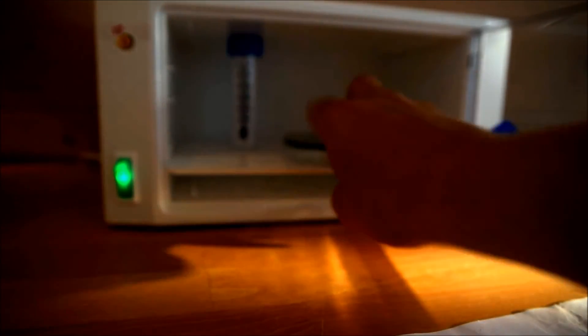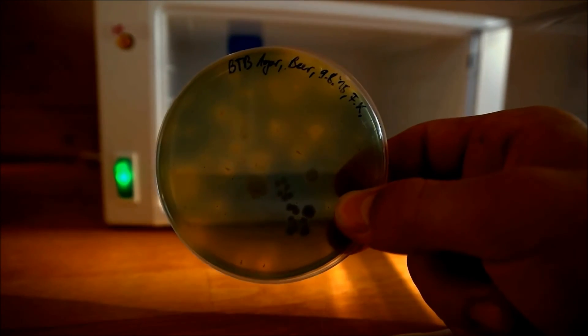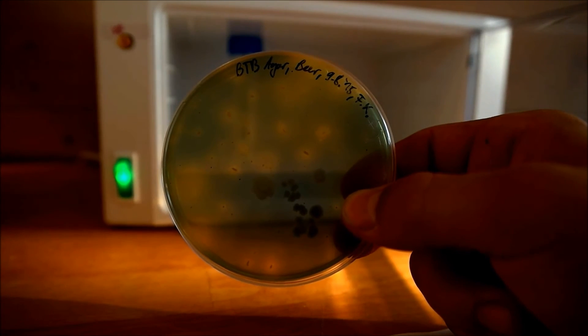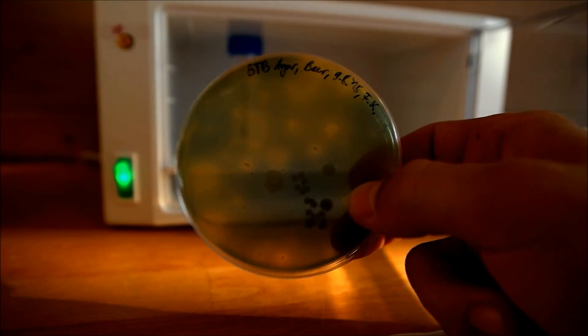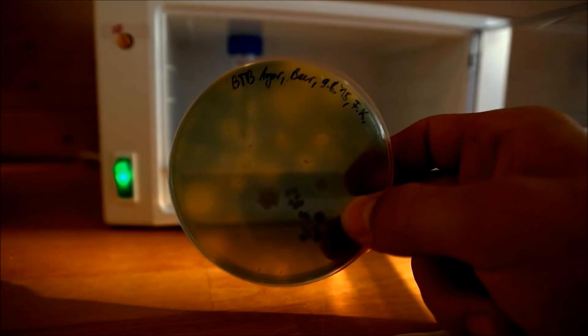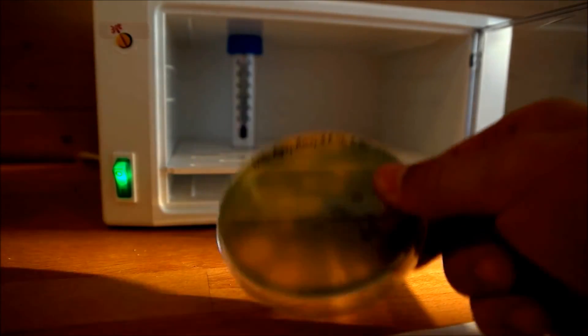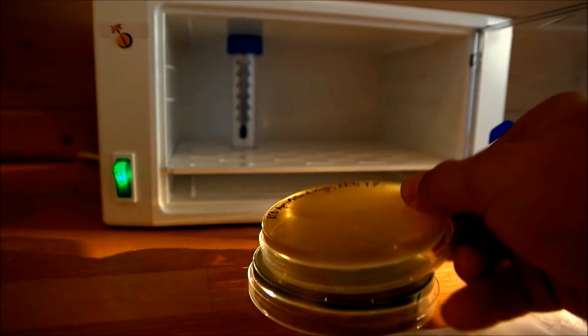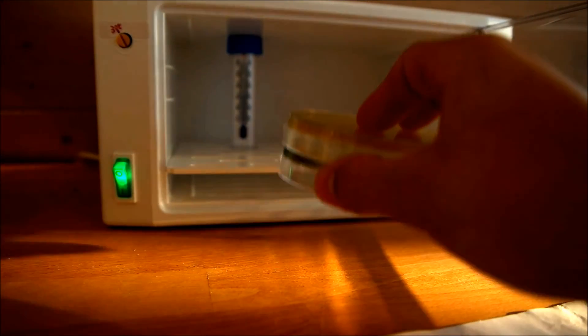It didn't work very well with the beer plate, because as you can see most parts are still kind of green. I think there were many other bacteria — maybe from the insects or which fell from the air into the beer — and they don't produce acid, which is why it's mostly still green. But now you can take your Acetobacter bacteria and put them in the freezer with glycerol to work with them even months later — I showed you that in another video.